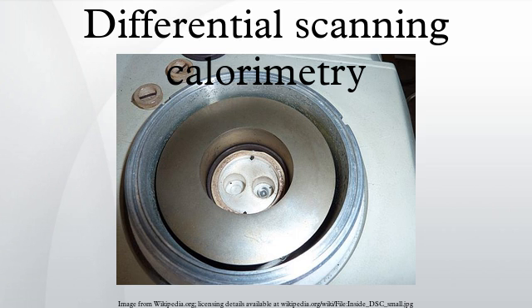Drug analysis. DSC is widely used in the pharmaceutical and polymer industries. For the polymer chemist, DSC is a handy tool for studying curing processes, which allows the fine-tuning of polymer properties. The cross-linking of polymer molecules that occurs in the curing process is exothermic, resulting in a positive peak in the DSC curve that usually appears soon after the glass transition. In the pharmaceutical industry, it is necessary to have well-characterized drug compounds in order to define processing parameters. For instance, if it is necessary to deliver a drug in the amorphous form, it is desirable to process the drug at temperatures below those at which crystallization can occur.